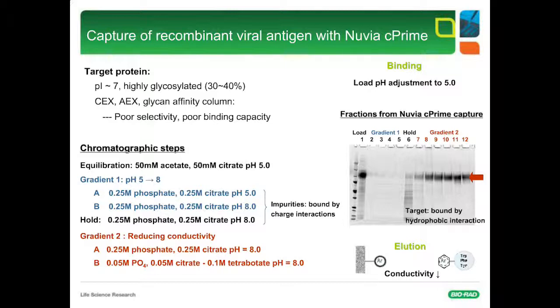And as a class, mixed mode resins are becoming obviously a lot more popular because a lot of the molecules that are coming into the pipeline from upstream are posing these challenges that call for that. So there is really no need to worry about mixed mode resins being around or being successful for the lifetime of a product into commercial scale manufacturing.